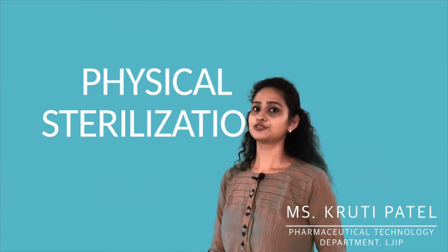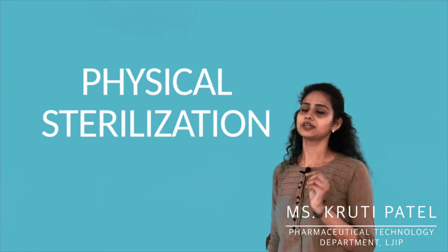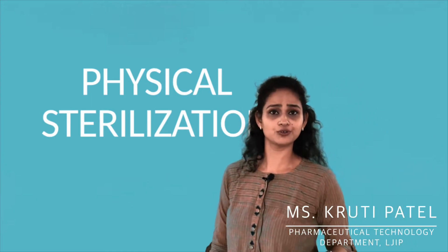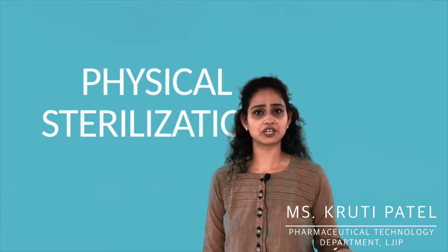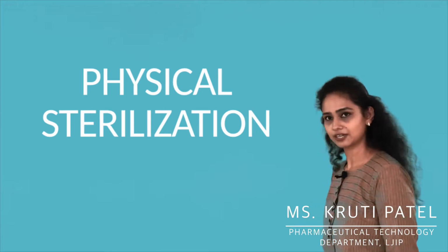Today we are going to continue with sterilization only. In sterilization, we had seen the overview of sterilization methods and chemical sterilization methods. Today we are going to start with the physical methods of sterilization.